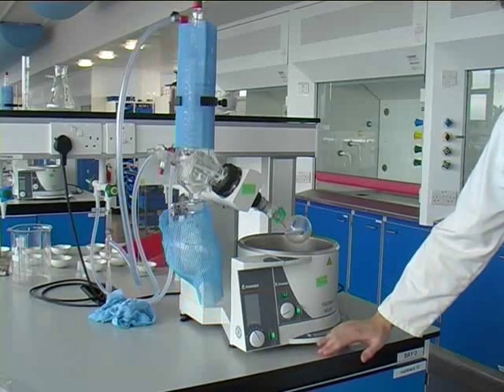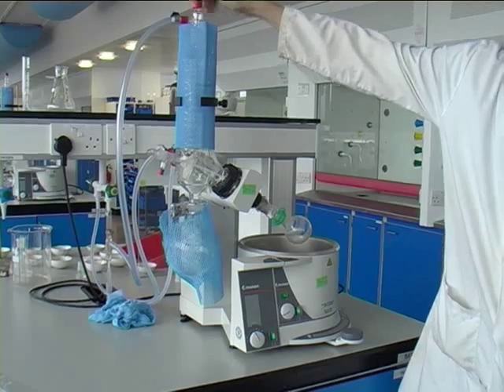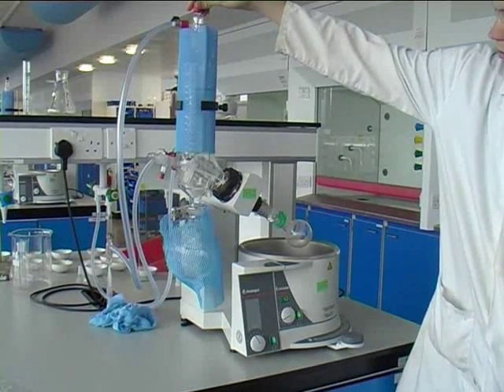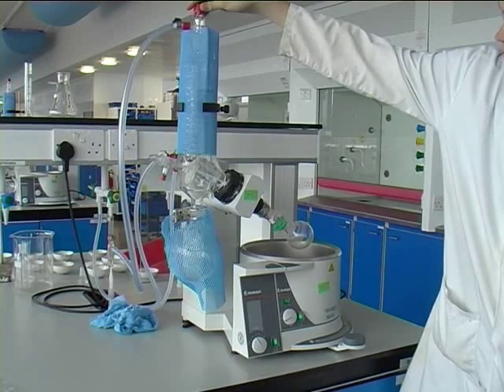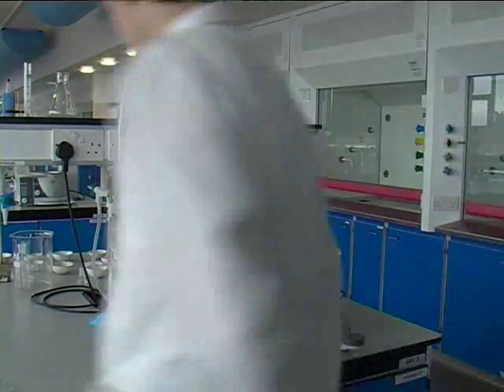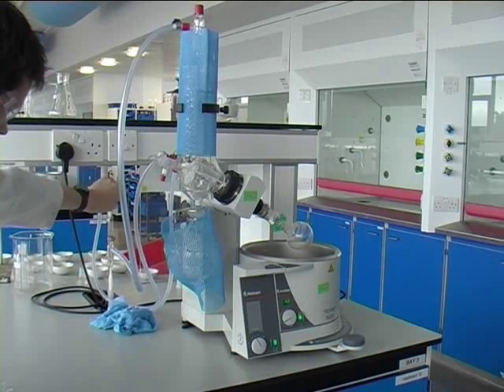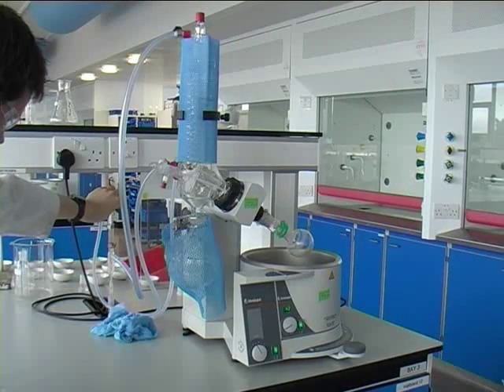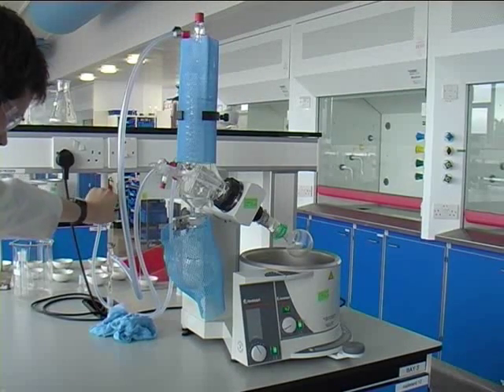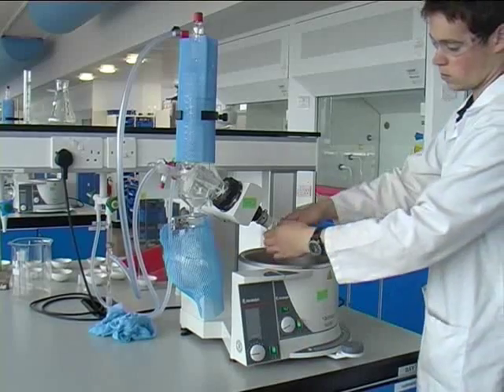And when all the solvent has been removed, lift out of the water and gently release the flask, taking care not to drop it into the water bath.